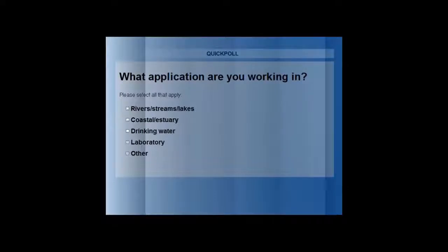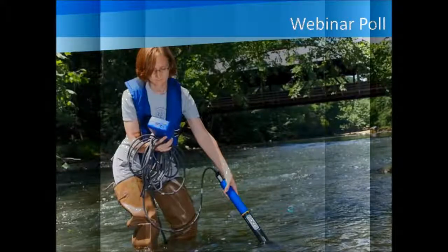Great. Okay, looks like most of the folks are finished voting in the poll, so I will close the poll. And the predominant application is natural waters, as we can see in rivers, lakes, and streams. So lots of good feedback there. As we move along in the webinar, we're going to have a few more slides that will discuss algae sensor interferences, and then as Tim mentioned, we'll get into some calibration of the algae sensor. And first we'll hear from Brandon.